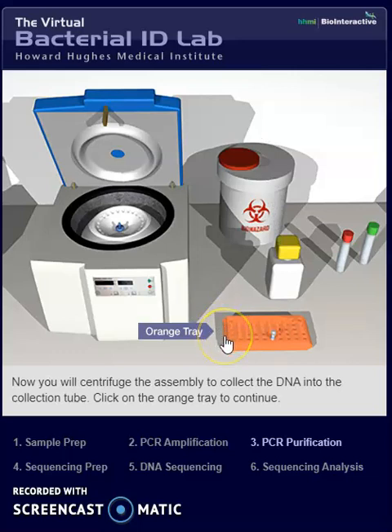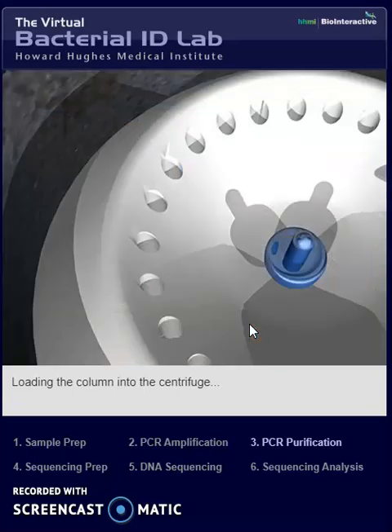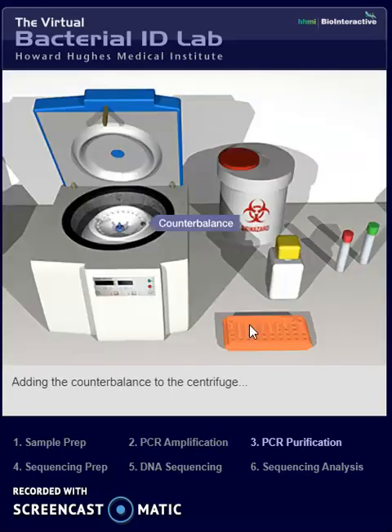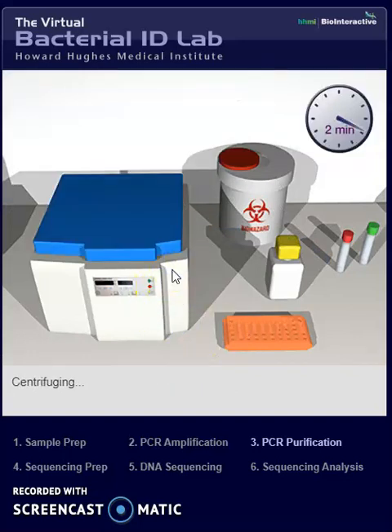Now you will centrifuge the assembly to collect the DNA into the collection tube. Add the counterbalance. Click the centrifuge to continue.